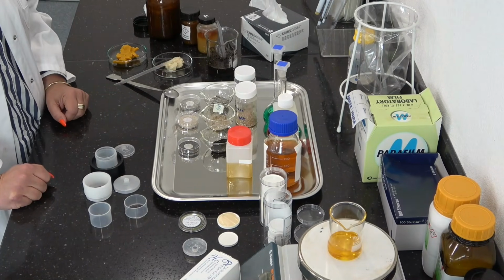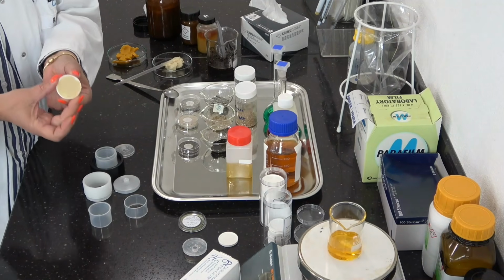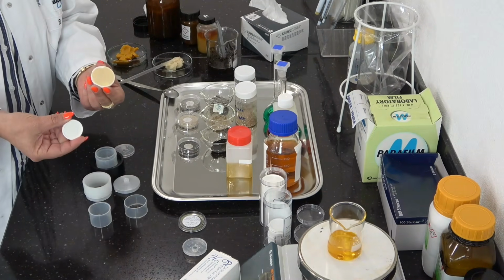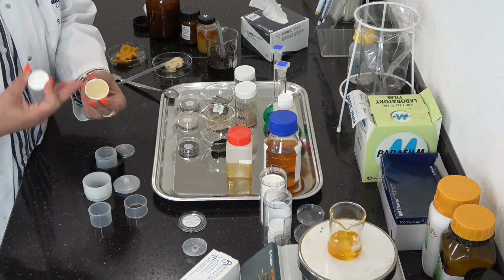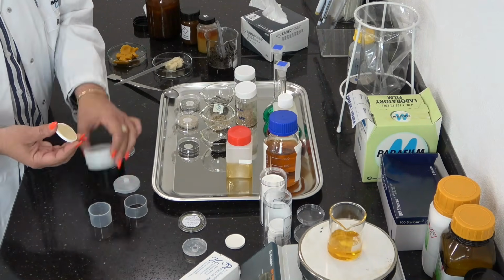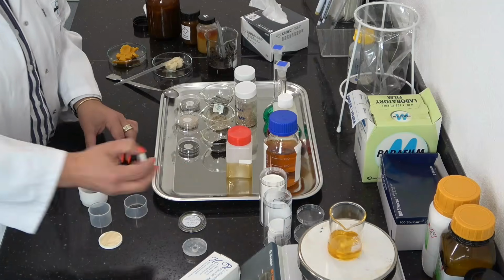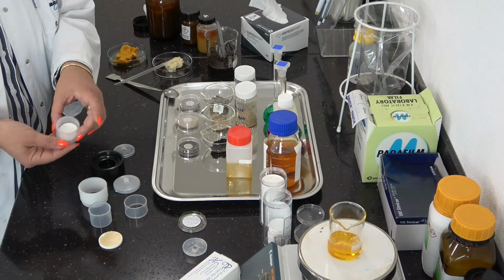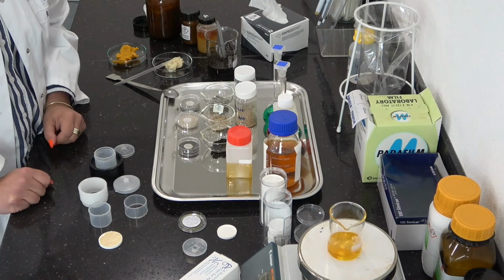So in this case, you can also use some kind of grease cups, which you can buy ready to use. So this is how they look like. You can very easily put a greasy sample or, let's say, a more solid sample into these cups, and then it's very easy to put it directly into a liquid cup like here, or if you have a smaller cup, these cups are also available in different diameters. You can also put it into this cup. So this is also a very easy way to work with more greasy or more solid samples.